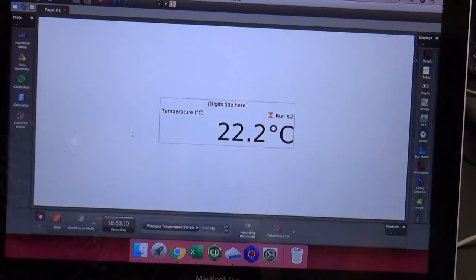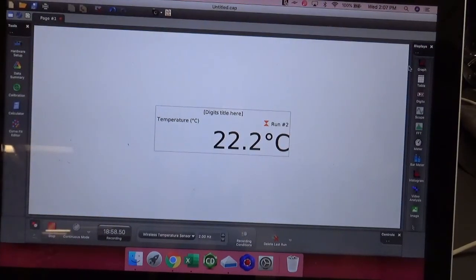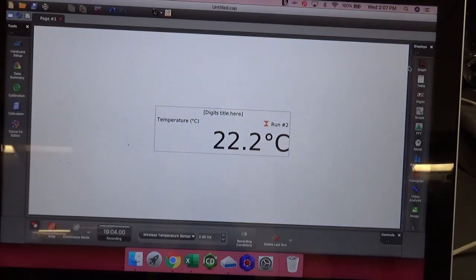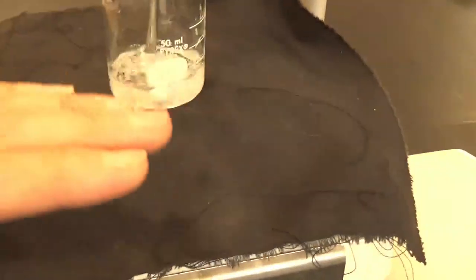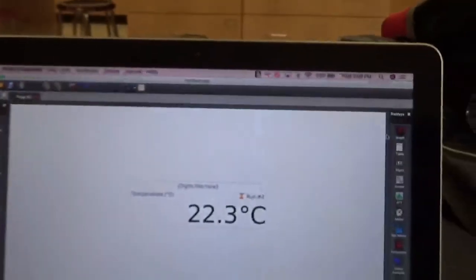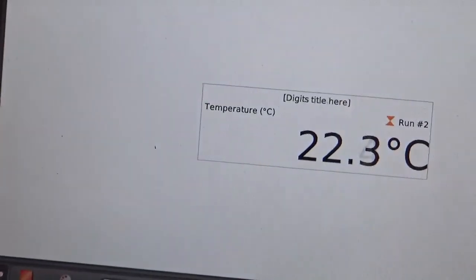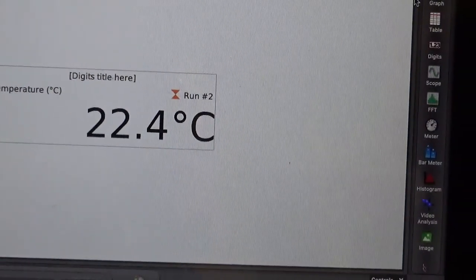All right. Is it going up? It went down. Did it go up at all? I don't think so. And the heater does feel a little warm when I touch it with my hand. Okay, there it is, went up 1/10 of a degree. So I put a little tiny bit of heat on, but then shut it off. But it feels a little warm. And like I said, the key to this is to do it slowly. So I'm going to be patient. It's still going up.